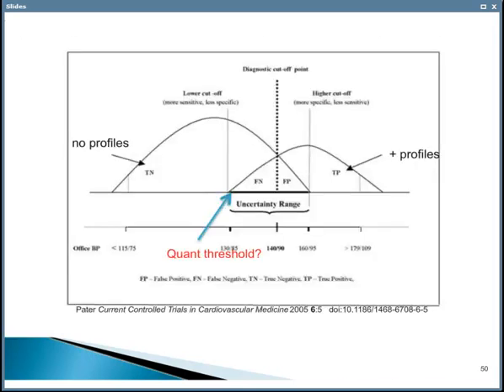So I think our conclusions are the following. What I've shown in this graph is the typical situation where you look at true positives and true negatives. So what you have is two bell curves, one showing true positives (TP) and one showing true negatives. What I mean by true positives here is a situation where there are male profiles and you want to get them. The true negative means there's no profile there, you're not going to get anything, doesn't matter how hard you try.